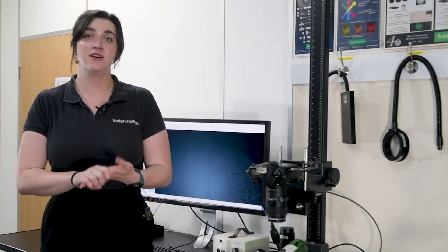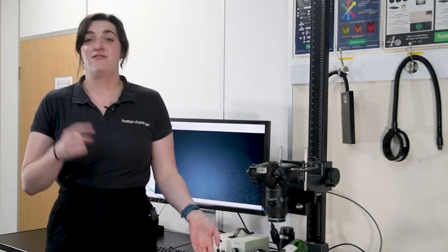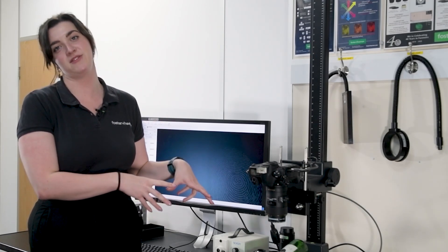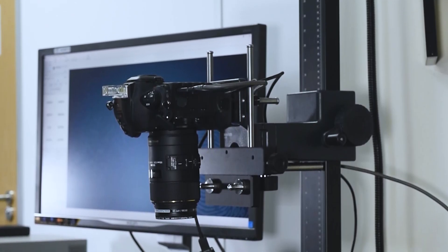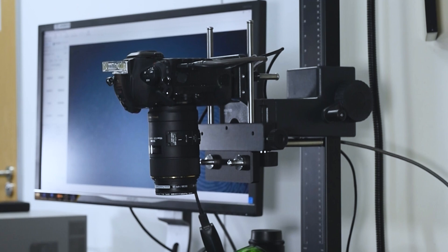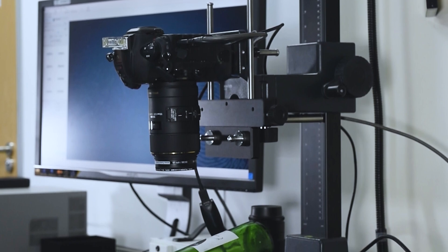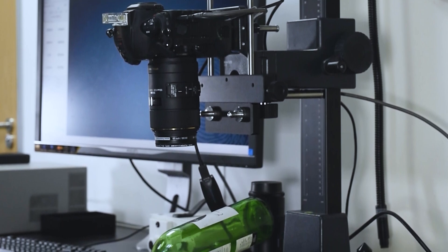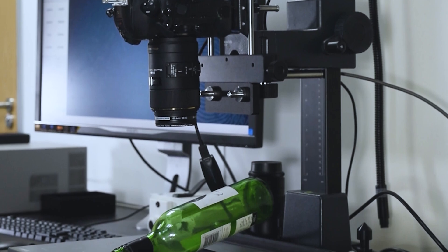Throughout this webinar, we're going to focus our demos primarily around the DCS. That's because if a finger mark is challenging, we're going to need the best of the best to photograph it. The DCS itself is made up of specialist lighting attachments, a high resolution camera, and specially designed fingerprint enhancement software that all work together cohesively, meaning we are able to photograph any fingerprint on any background. That's why we use the DCS when it comes to challenging finger marks.